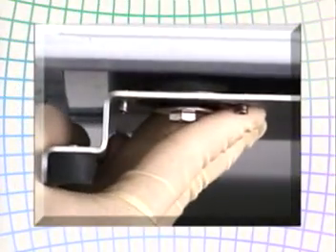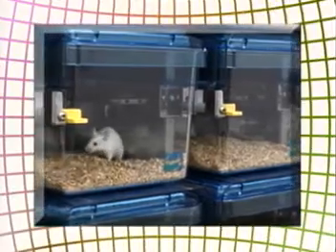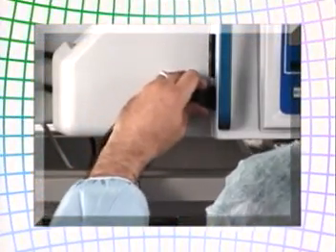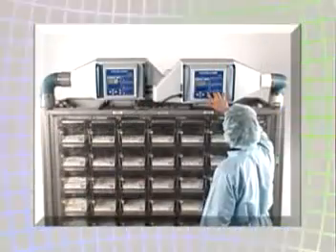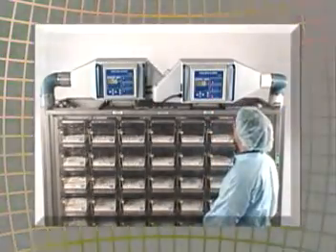These units perform quietly with virtually zero vibration carried through to individual cages. The energy efficiency provides enough savings in electrical consumption to pay for the initial cost over the lifetime of the unit compared to older designs.